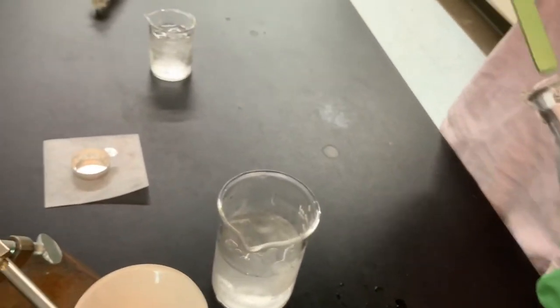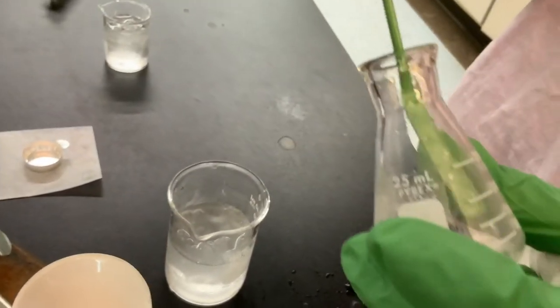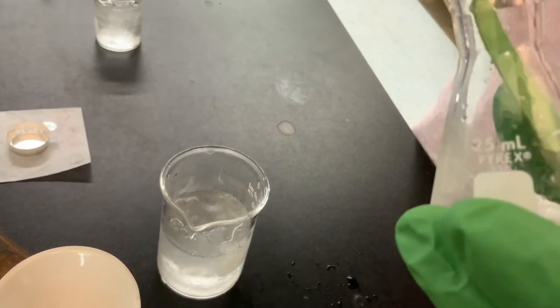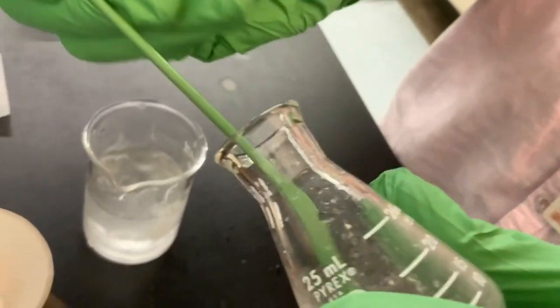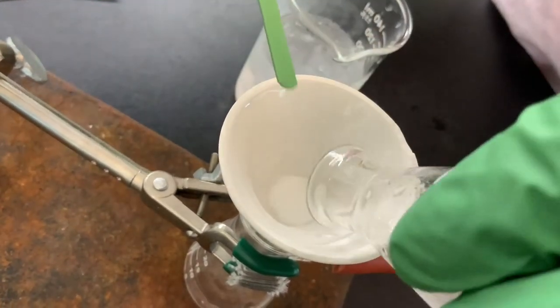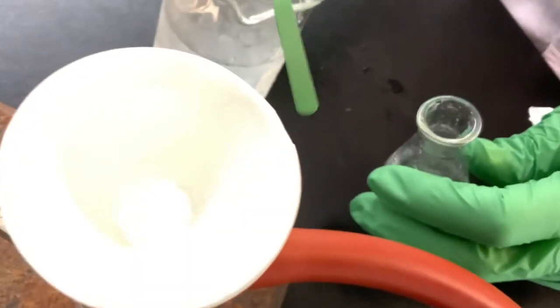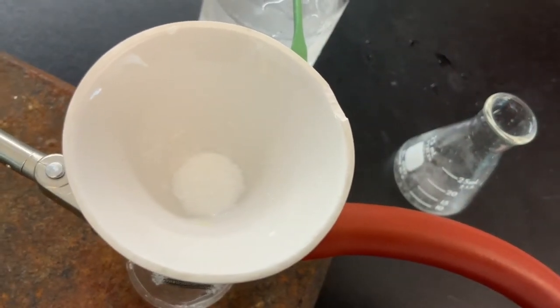And there's still a little bit of water, so I'm gonna try and scrape out some of this. So what I'm doing here is I'm scraping down on this side, trying to get it in the remaining water that's present. And then doing that. All right. And so then the procedure says to rinse this with cold distilled water.